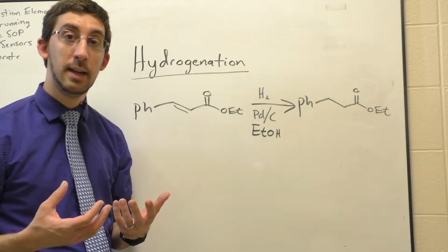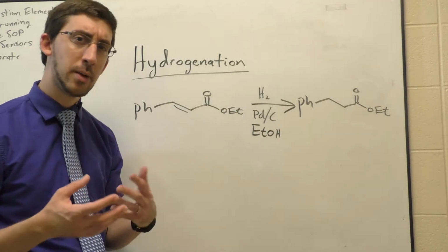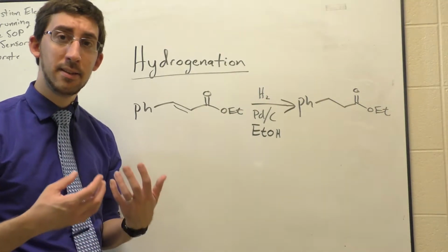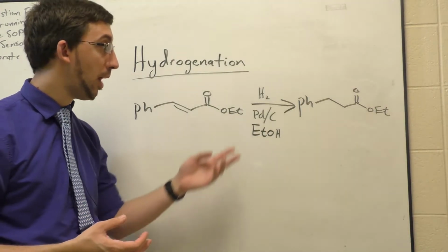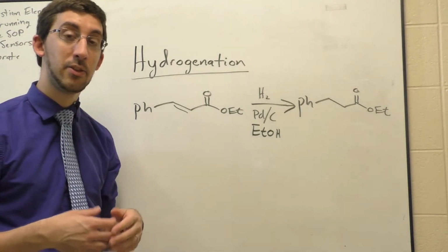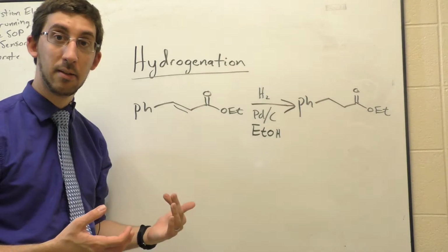Hydrogenation. It's one of the earliest organic reactions that you learn after learning about nucleophilic substitution. It involves the simplest addition of molecules to an alkene, or you can also do this to an alkyne. All we add is 2 hydrogen atoms across the double bond of an alkene to give us an alkane, or we could do it twice to an alkyne to give us an alkane.